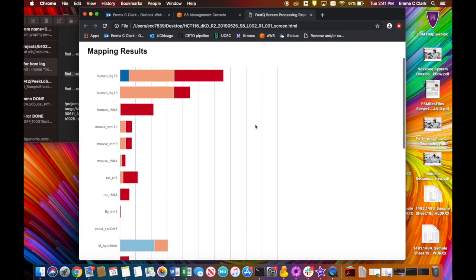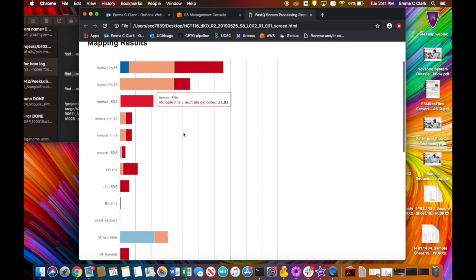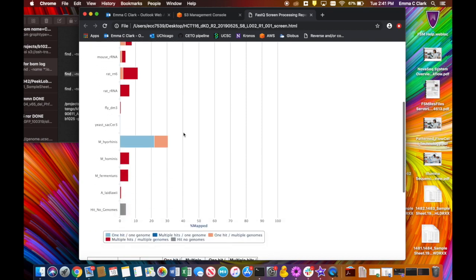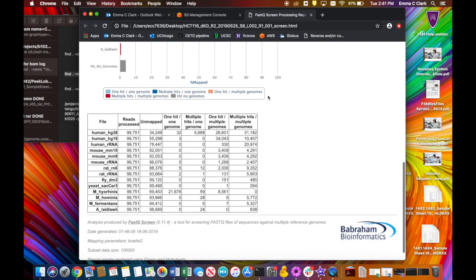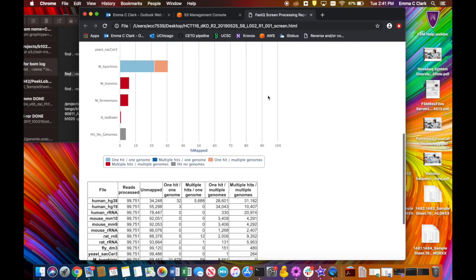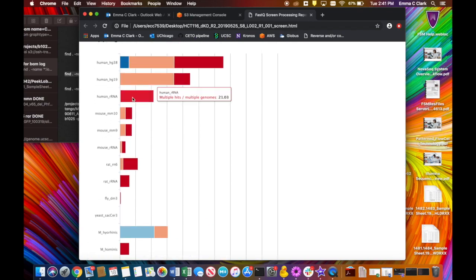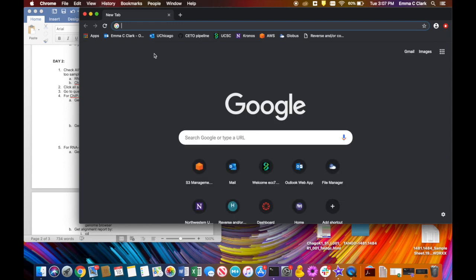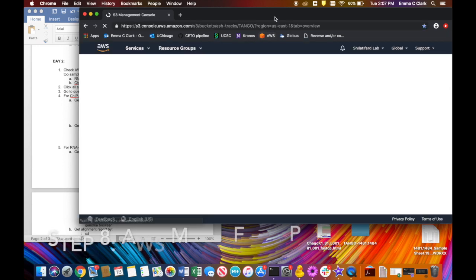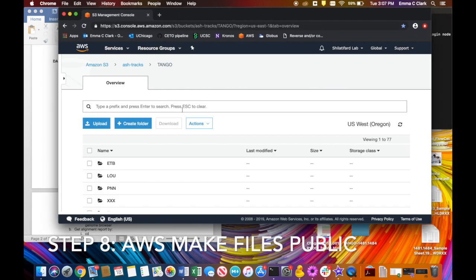For this one, you can see that it has a ribosomal content of 21%, so that's okay. But then there's this other thing down here that could be a potential contaminant, which we discussed later when we sent out the email. Typically that doesn't even show up, and typically the ribosomal content is sometimes lower than that, but it's okay that it's below 30%.